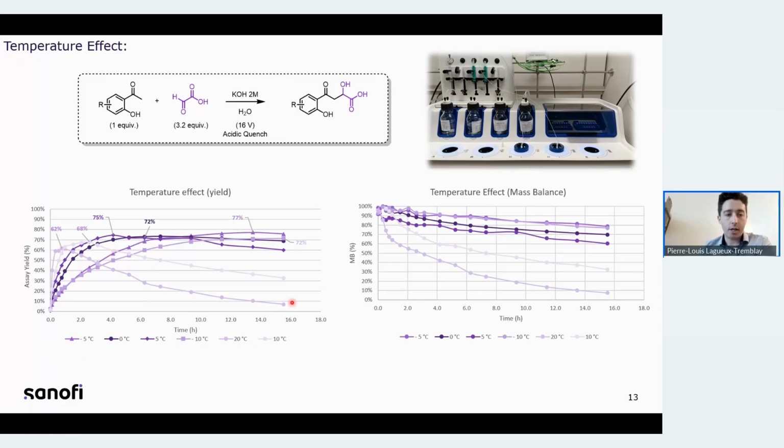And if you compare those kinetics, it is quite interesting, because if you compared, for example, traditionally everything after 16 hours or so, what you will observe is that room temperature is very bad, and perhaps -5 is really good. However, this is not necessarily relevant at one data point. If you look across multiple data points, so 18 data points, for example, you can see that room temperature could perform pretty well, but you'll have to stop it after about 30 minutes, compared to reaching the maximum yield, for example, at -5, where you will need at least between 6 to 10 hours.